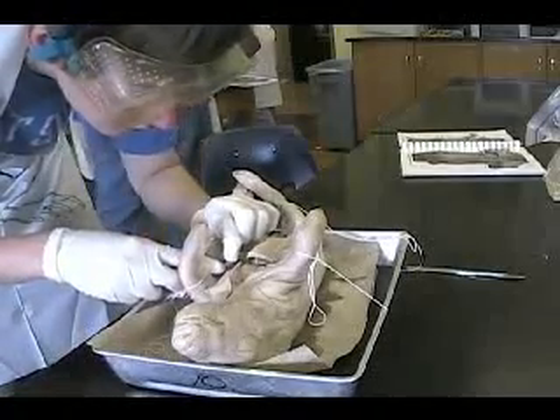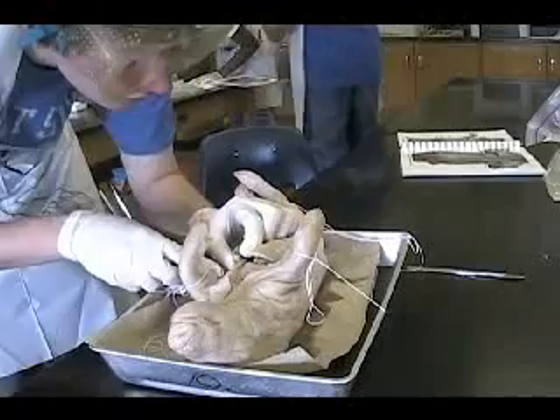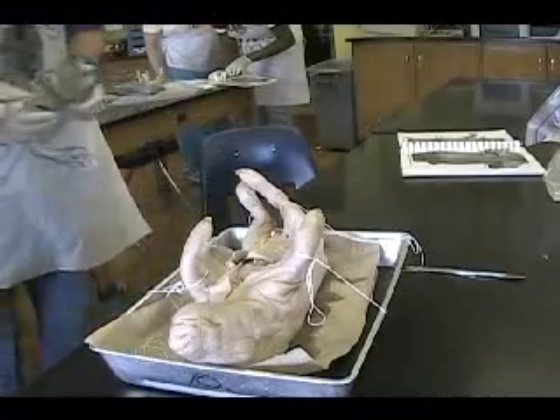That's your target though. I can't see. I can't see. Thank you.